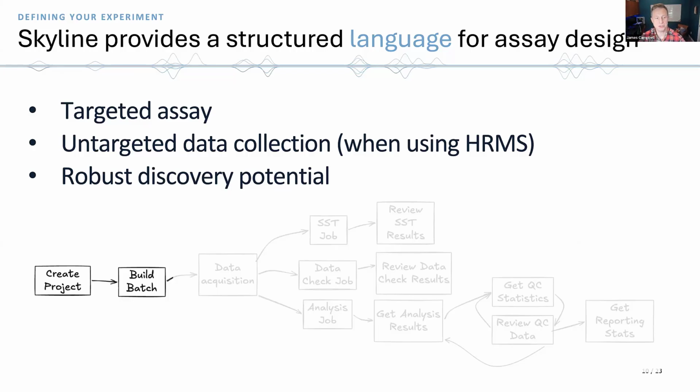In this initial phase, users tell us about the sample, the matrix, everything that we have in terms of understanding the context for the experiment. And then we build the protocol for everything from sample prep to chromatography and prepare run lists for acquisition.